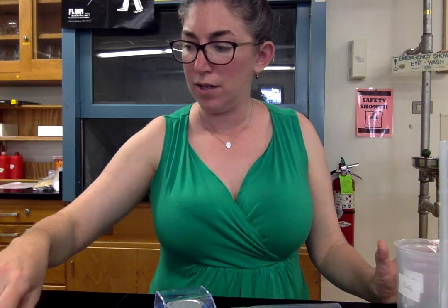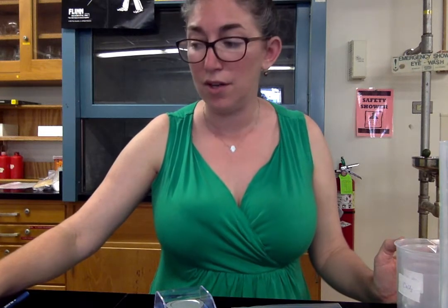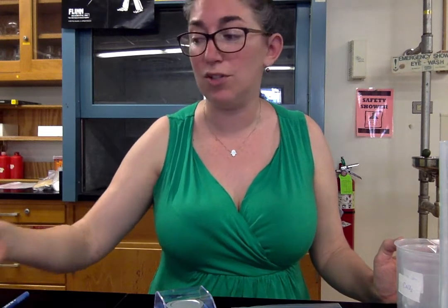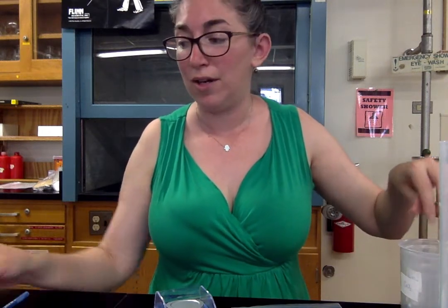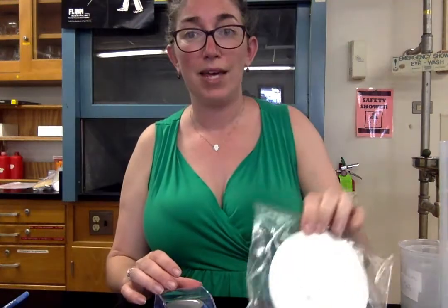For this lab, you're going to be doing multiple parts. You're going to be practicing making solutions. So the first thing you need to do before you can even do the lab is figure out and do calculations to figure out how much of these different salts you're going to be using to make solutions of certain concentrations.